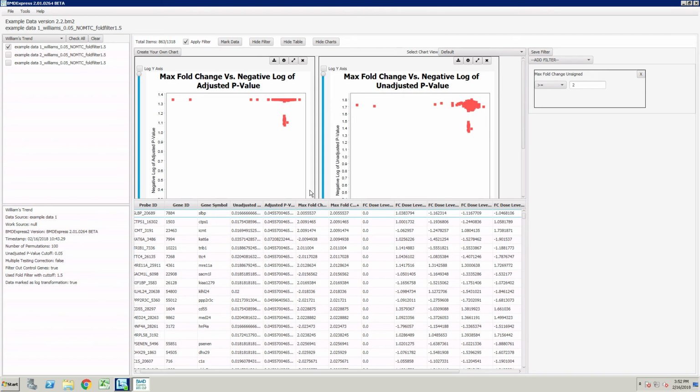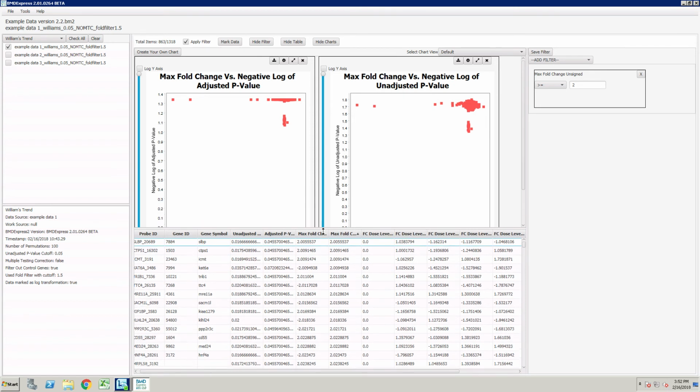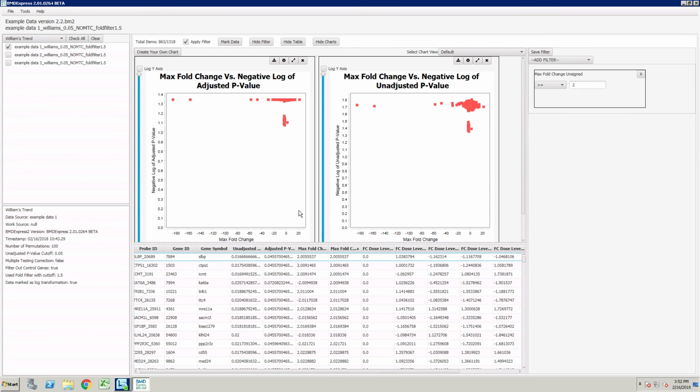There's other functionality in here that I'm not going to cover right now, and I'll cover in other sections, but there's different ways of labeling. You can shift click and label certain nodes. You can do a number of different things with the visuals, but we'll touch on the visuals later. I want to work through the analysis right now.